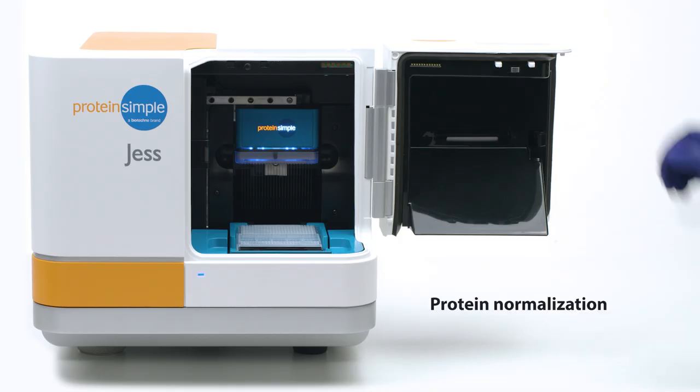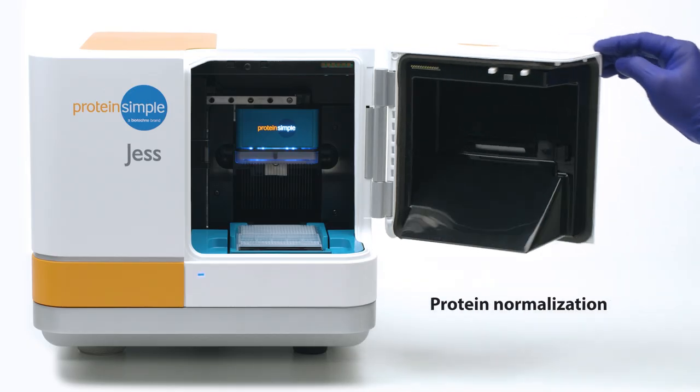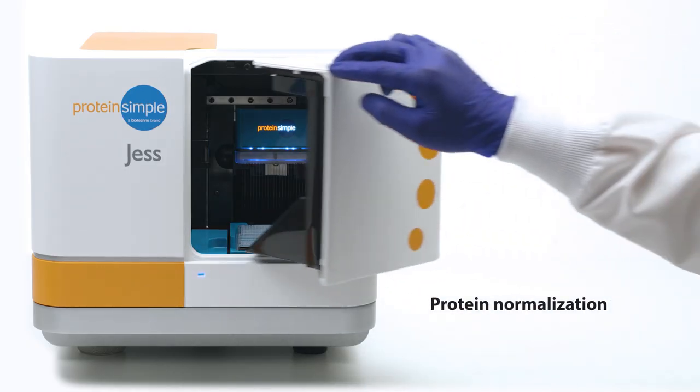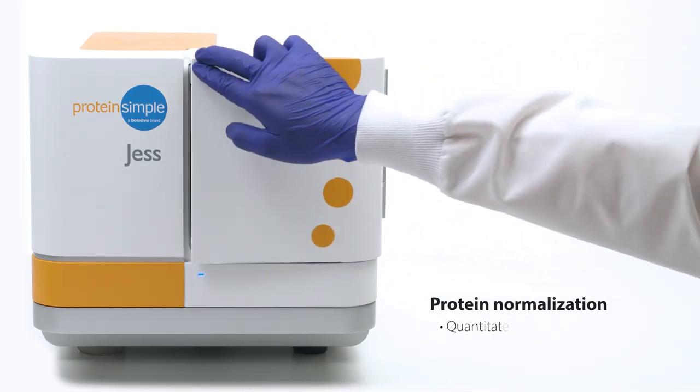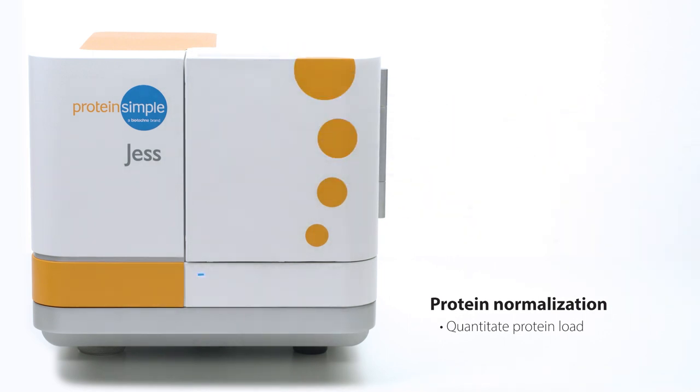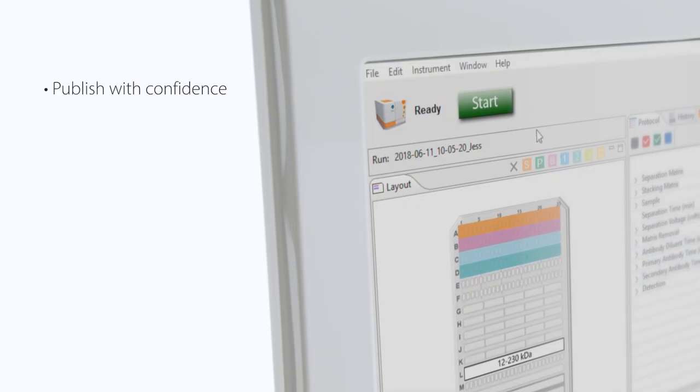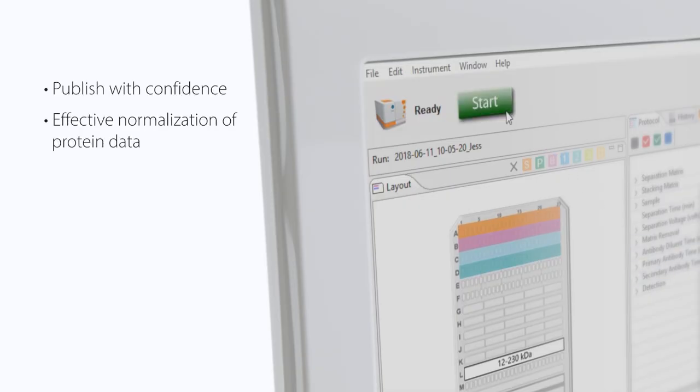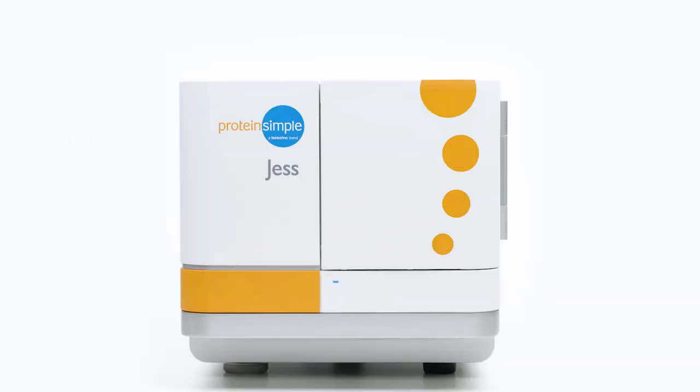Her in-capillary protein normalization reagent is an easy way to see if your samples contain a consistent protein load and investigate experimental setup and user errors. You'll be able to publish your results with confidence, with effective normalization of your target protein expression.